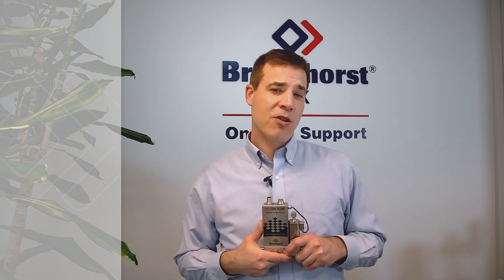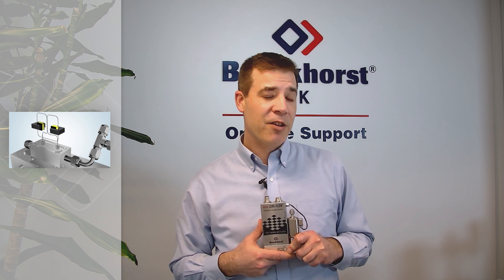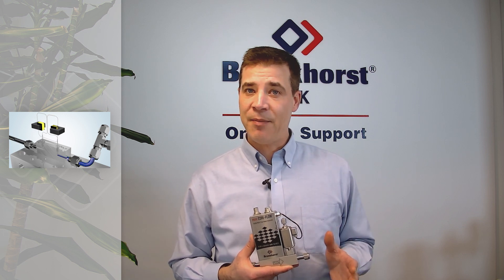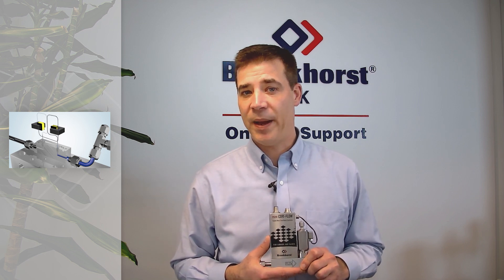The Bronkhorst Coriolis range uses the Coriolis measurement principle. This uses a pure mass flow measurement technique, which means you can also measure the density and the temperature of your fluid — a great additional benefit.